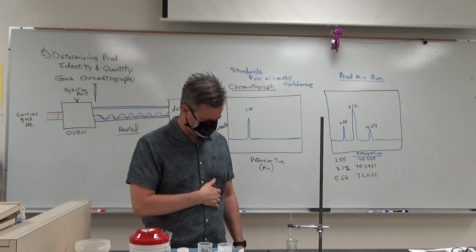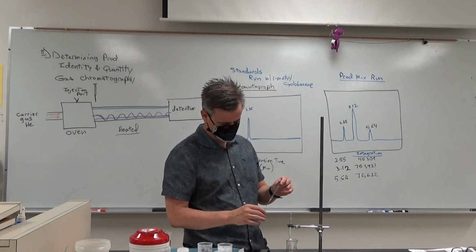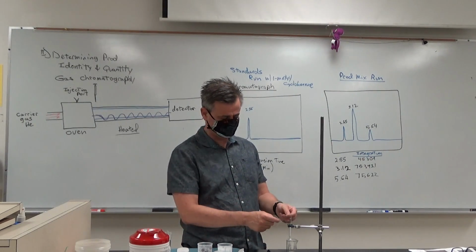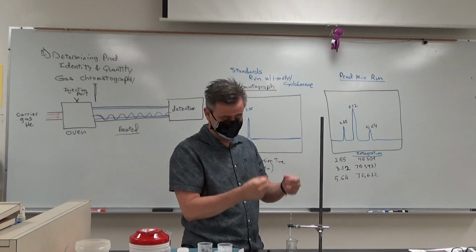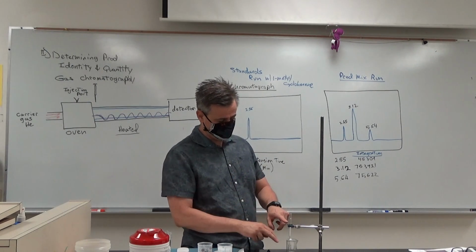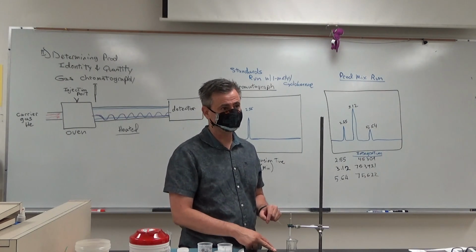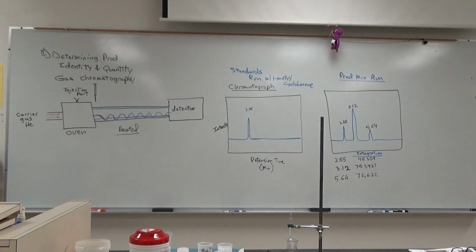Okay, and now I get another pipette. I've got my stuff in here. Okay, and I'm going to start pipetting it through the silica gel. The silica gel will grab all the acid, okay, and it'll go down into this vial here. All right. What'll happen is it'll puddle up here, and it'll go drip, drip, drip. Okay. If you want it to go faster, you can do it in about 10 minutes, or you can do it in about 10 seconds.